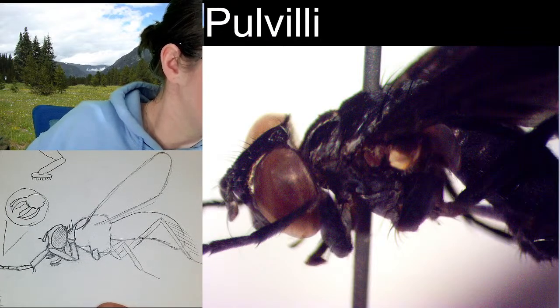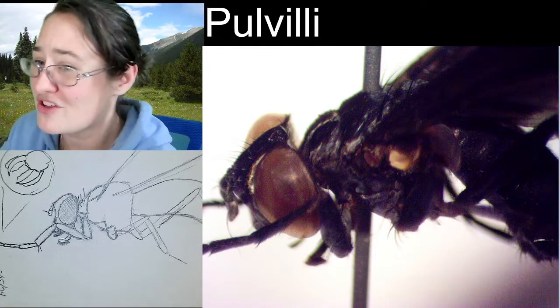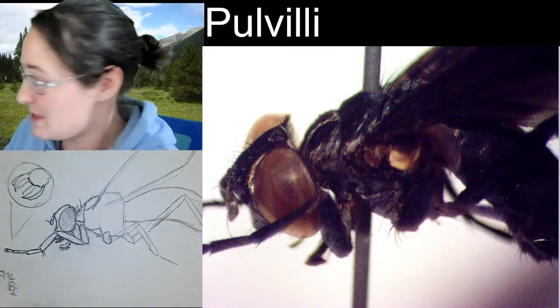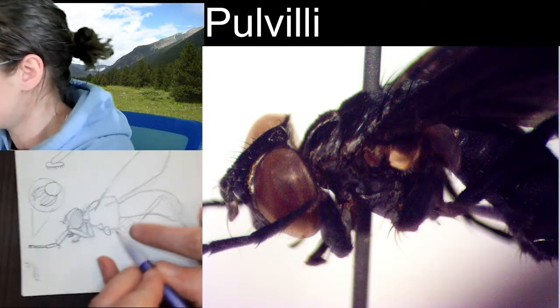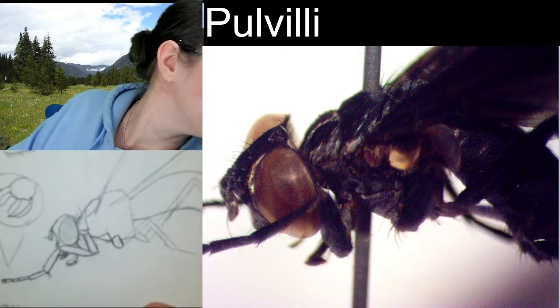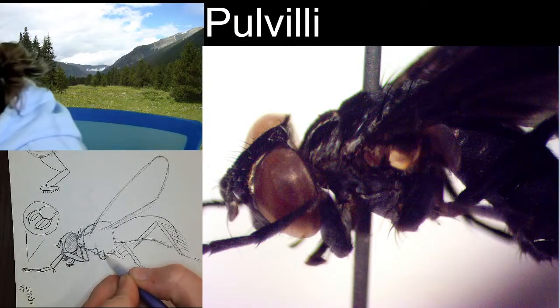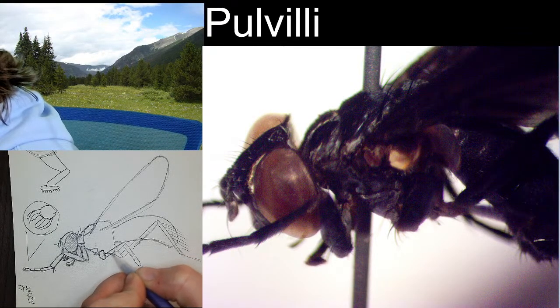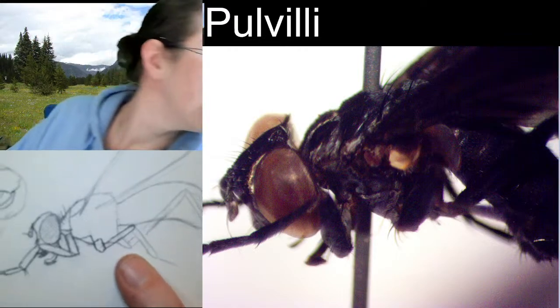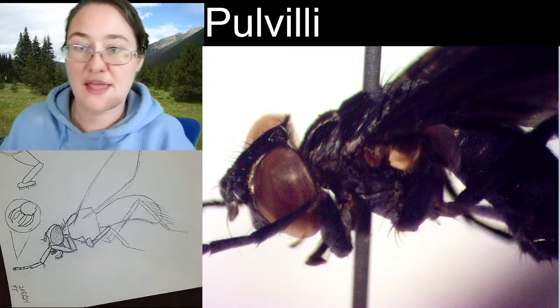on this fly. It's really tricky because I believe at some point, maybe this fly broke its leg and I glued it back on upside down, but that's not what it looks like. What it looks like is the fly's leg bent backwards. But the femur is going to be really hard to see because of that. So what we'll do is, I'll just explain to you what it looks like. And honestly, it's going to be very similar to the front leg. Yeah. The front and the middle leg are very, very similar in structure. So we've got the femur. It's going to be coming up like that. That's about right. I'm going to erase any of those little sketch lines on the inside I don't need. And I can show you the tibia.